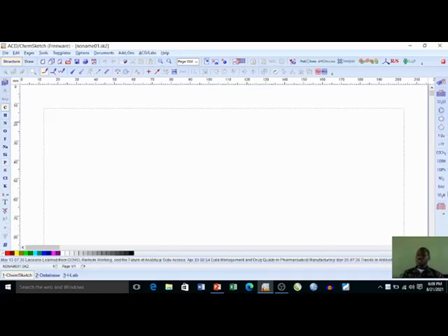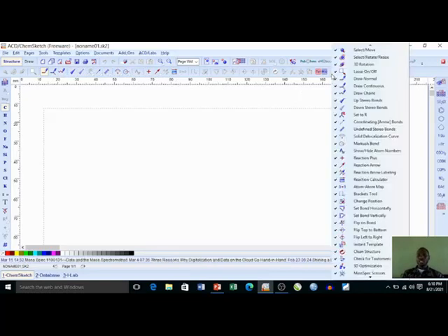Here are some substituents. Here is the periodic table. These are some of the other functionalities which I would like to look at in more detail. I will click on the show buttons here. Now, this functionality stands for select and move. So perhaps you put down a structure and you want to continue, you just click on the mode here. We have the select and rotate size. We have the 3D rotation, the lasso on and off, to draw normal and to draw a continuous structure.